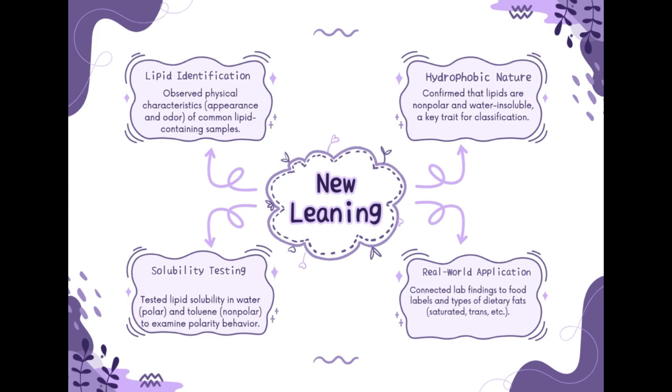In practical 3, we learn lipids and their physical characteristics. In this practical, we have tested the appearance, odor, and the solubility of 3 lipid-containing food samples. These samples were mixed separately with water and with toluene, a non-polar solvent. Through this, we discovered that lipids are insoluble in water but soluble in non-polar solvent, confirming their hydrophobic nature. And they have unique physical traits that can be used for identification in food and biological systems.